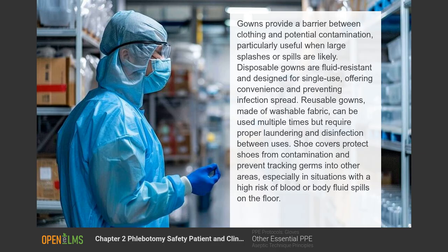Disposable gowns are fluid resistant and designed for single use, offering convenience and preventing infection spread. Reusable gowns, made of washable fabric, can be used multiple times, but require proper laundering and disinfection between uses. Shoe covers.